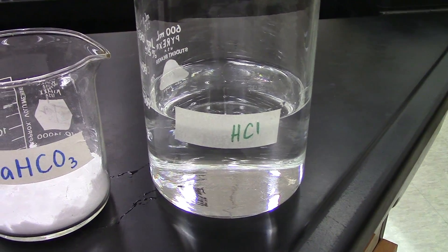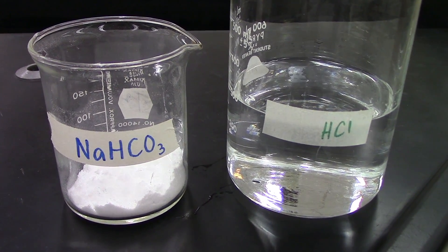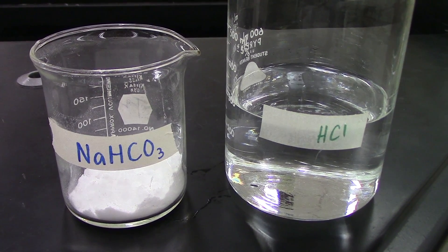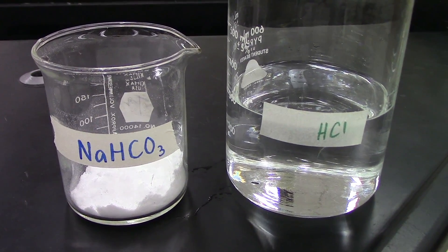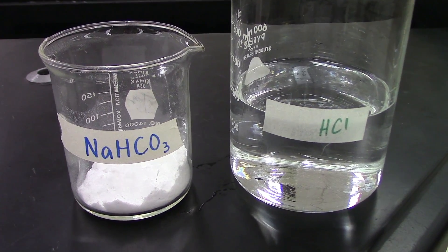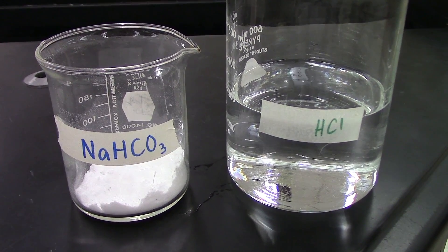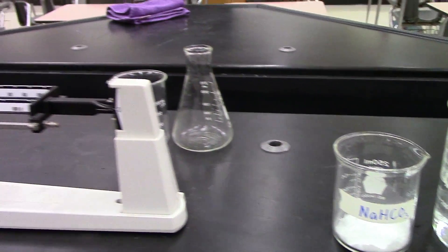When the baking soda reacts with the hydrochloric acid, we'll get carbon dioxide produced as a byproduct. We will measure the mass of our reactants and then measure the mass of our products. The difference in those two masses should be the carbon dioxide that has bubbled away. That means it's very important to have extremely accurate measurement of our masses since we're dealing with relatively small quantities.